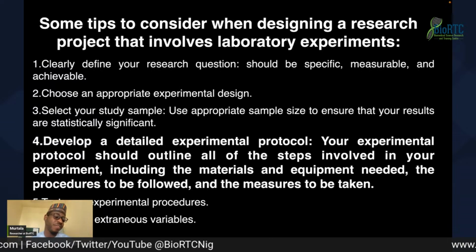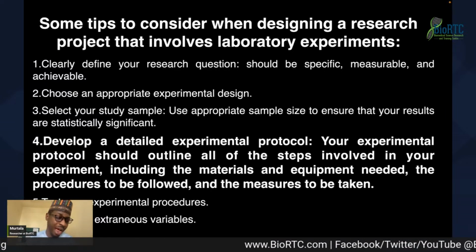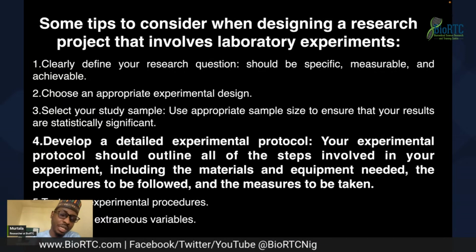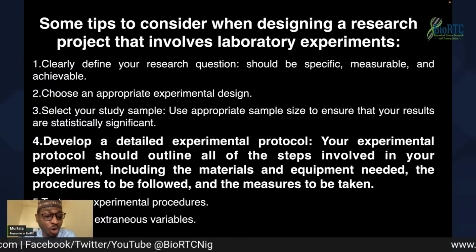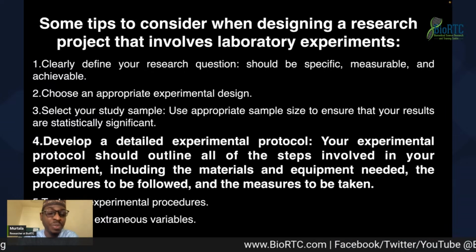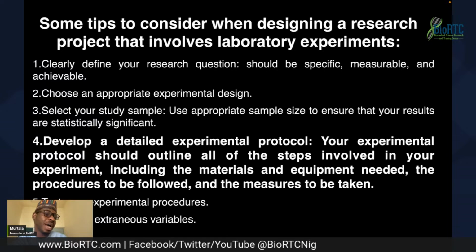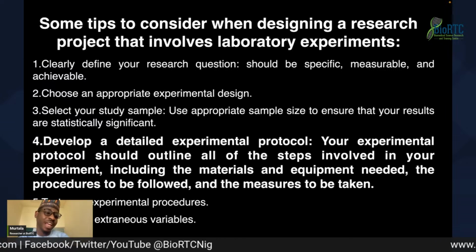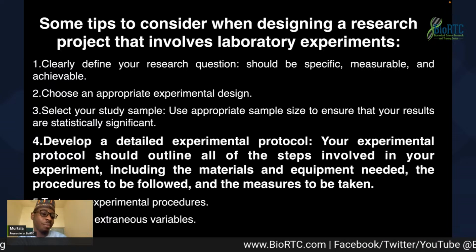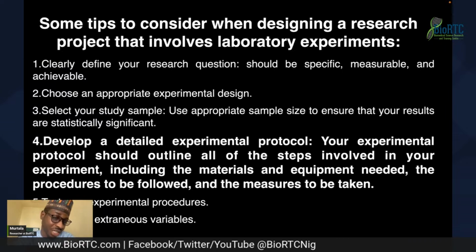So in this context, depending on the type of experiment you are going to do, plan your visit in 2 ways. The first time you are coming, you are solely going to test that your procedures are working. For example, I have some people that want to do a Western blot and measure the expression of caspase proteins. Caspases are proteins involved in apoptosis. Sometimes it may not be wise for you to run the experiments with all your groups, bring the samples, homogenize them, run SDS-PAGE and just blot with your precious antibodies.